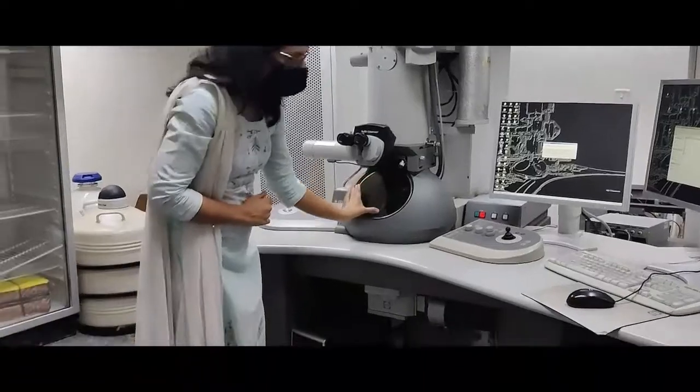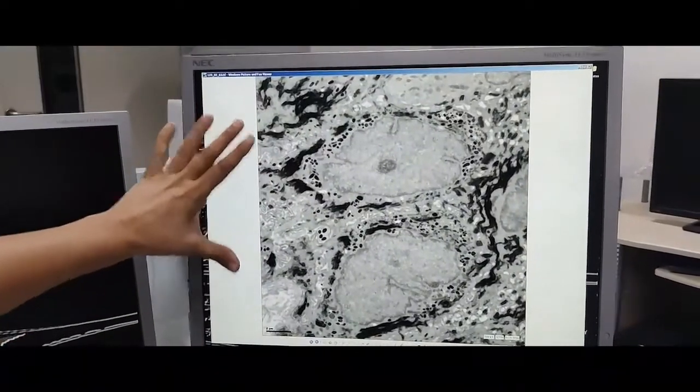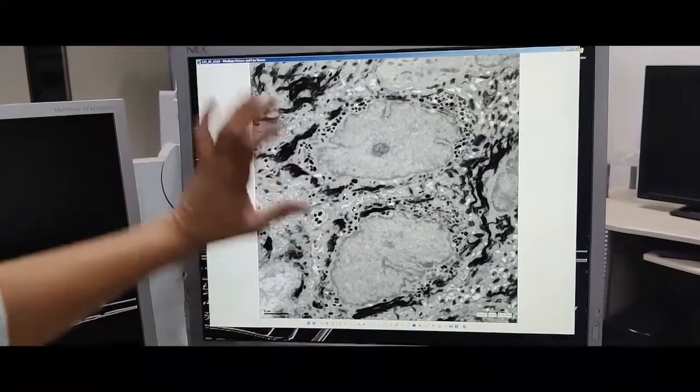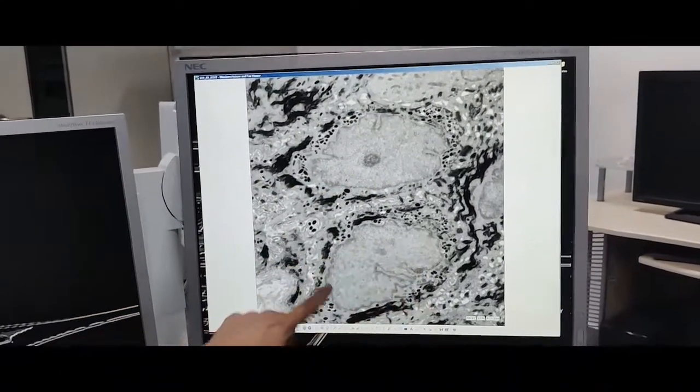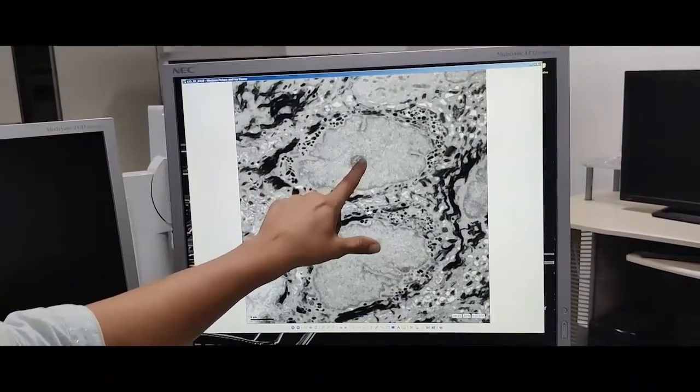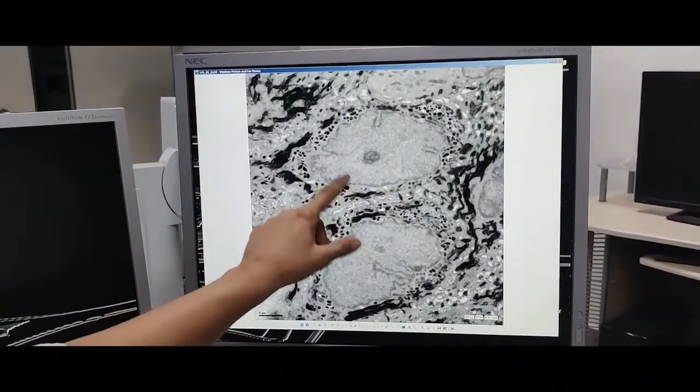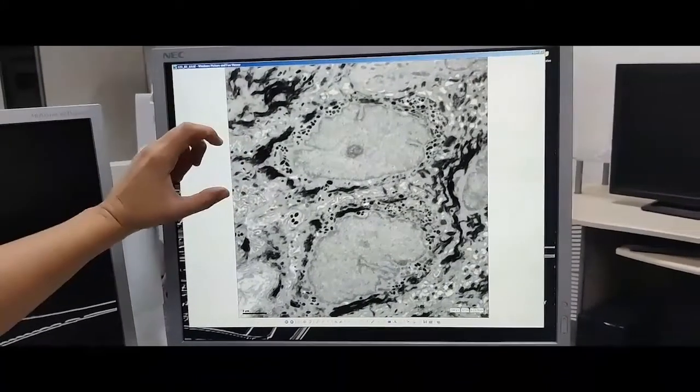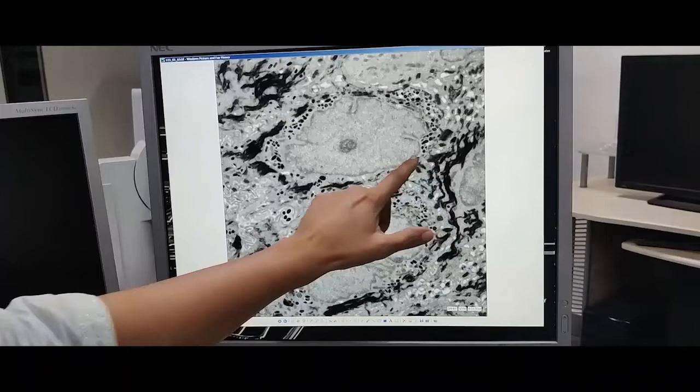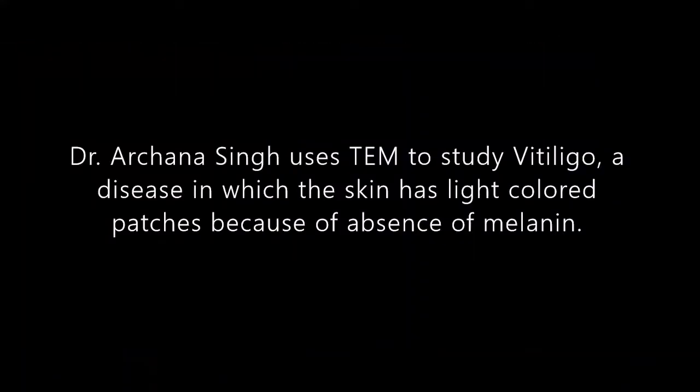What you see here is a fluorescent screen, but these days, we really don't use the screen for seeing. We directly transfer the images onto the digital media. This is a skin sample, a human skin sample, and what you see is two cells here. Now, how do you know these are two cells? Because you can see one nucleus here, this in a grey outline, and the other one is here. So, these are two cells, and what you see in between, please don't confuse this as the nucleus. This is the nucleolus. So, nucleolus, followed by nucleus, and then what you see here is actually the cytoplasm. And skin, as most of you would be aware of, contains a lot of pigment. The melanin pigment, which you see as this black pigmented electron dense granules. So, this is what gives our skin the characteristic colour.